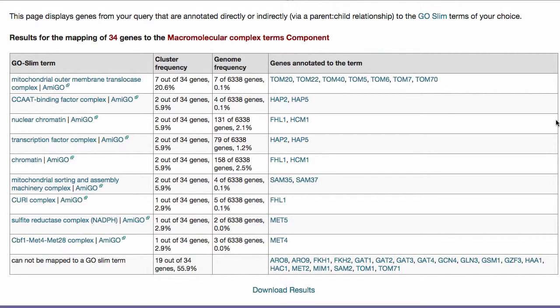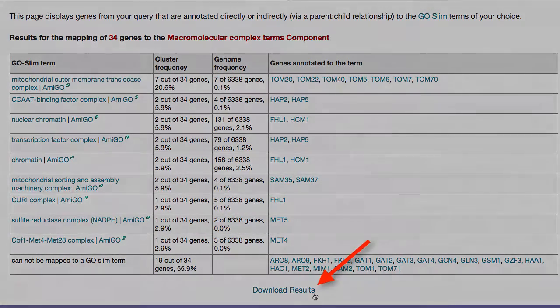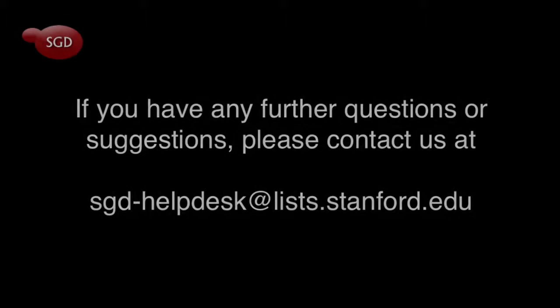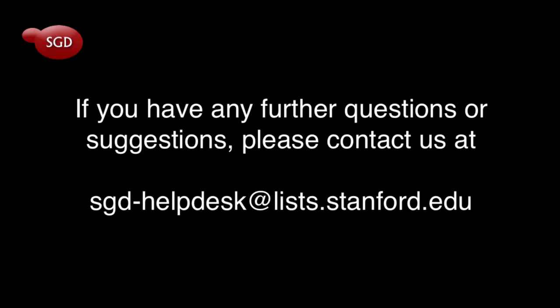If you'd like to take your results with you, click Download to generate a spreadsheet containing the information shown on the page. If you have any further questions or suggestions, please contact us at sgd-helpdesk@list.stanford.edu.